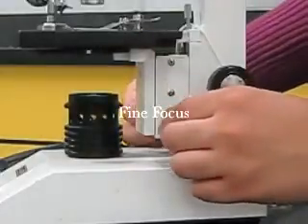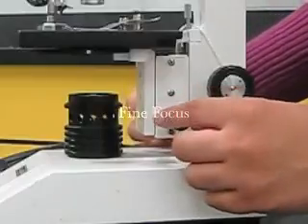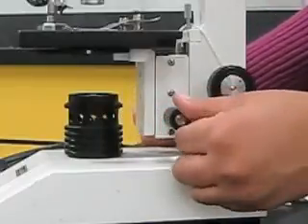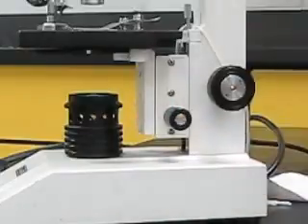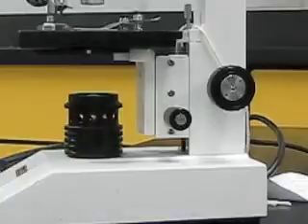The fine adjustment knob is similar to the coarse adjustment knob but smaller in size. The fine adjustment will move the stage up and down as well, but make smaller adjustments to the stage and field of view.